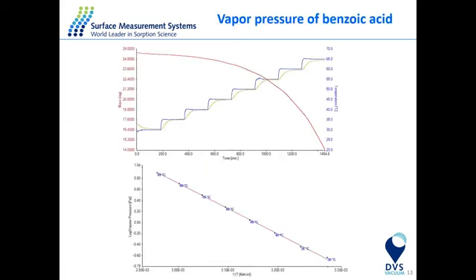The system is usually calibrated using a reference material like benzoic acid because its vapor pressure is well known. So in typical experiments, once you load the sample into the Knudsen cell, we pull a high vacuum, and then we expose the sample to different temperatures, and we wait at each temperature for several hours. In this case, we waited about 3 hours at each stage. I call each of these temperature steps a stage.